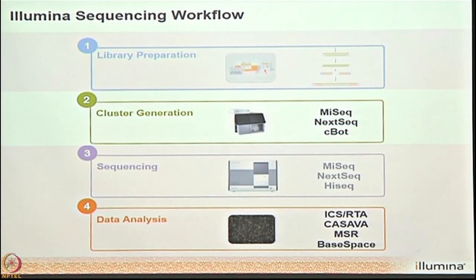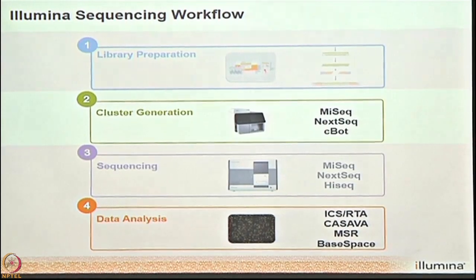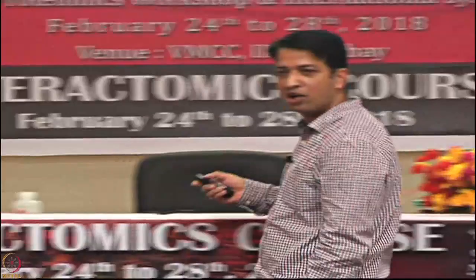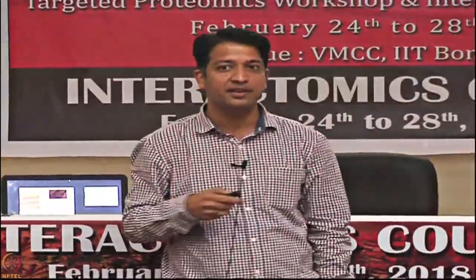So this is all about library preparation. Coming on to the cluster generation. So now what is cluster generation? Essentially, all the process happens on the flow cell, right? Flow cell is nothing but a glass slide.